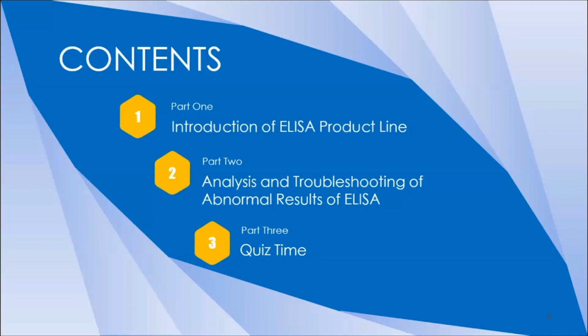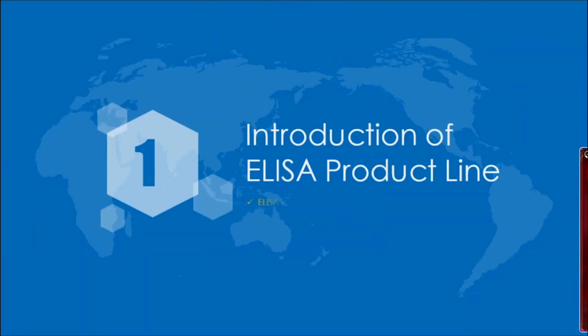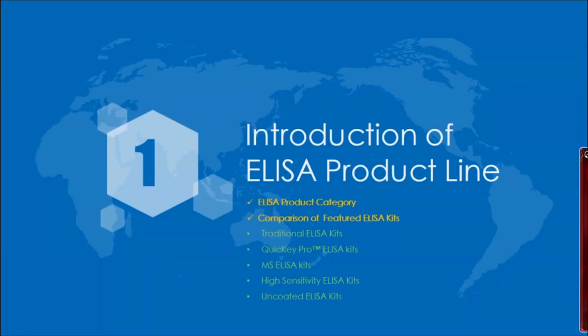Our topic today is mainly divided into three parts. In part one, I'll introduce you to our ELISA product lines, and in part two, we'll learn together how to analyze and troubleshoot the abnormal results of ELISA. And part three will be quiz time, and we also have gifts for you. Okay, now let's begin with the first part, the introduction about our ELISA products.